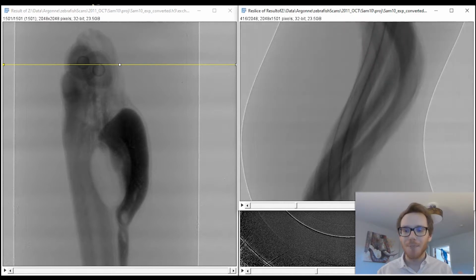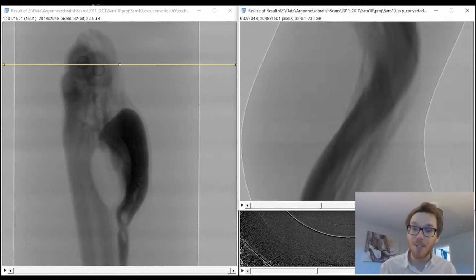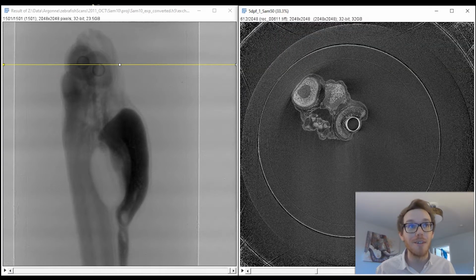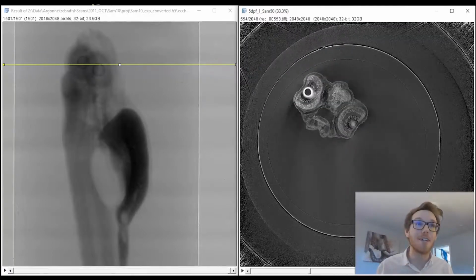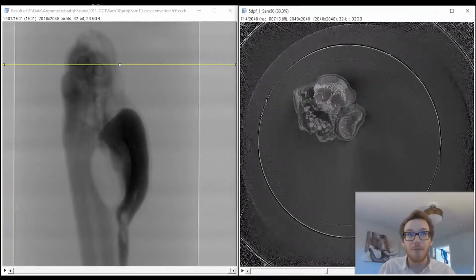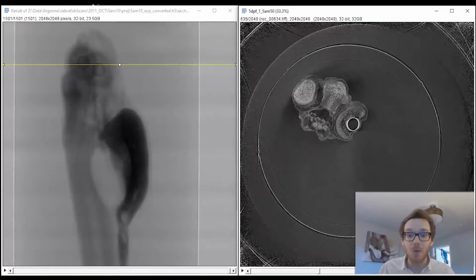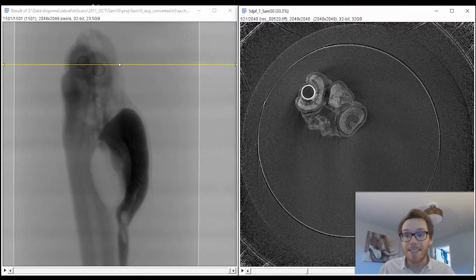If you look at the sinogram, you can see those lenses moving throughout space. It looks messy, but if you perform the Radon transformation on each one of those sinograms, you get these really beautiful cellular resolution images. And if you combine those together, you get the full digitized zebrafish. We're currently looking at the head of the zebrafish, and as I traverse down the stack, you can see the gut and swim bladder. Now we're back at the head, and you can see the lenses, which are those white circles in the brain of the zebrafish.